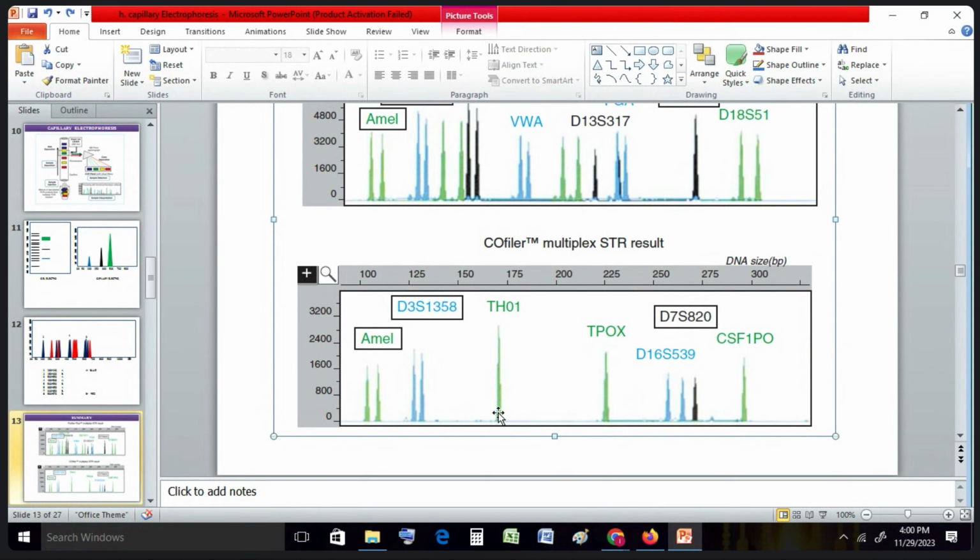I cannot get 3 different repeats from my mother and father. So it must be contamination. The sample may be contaminated and carry 2 individuals' DNA together. Okay.